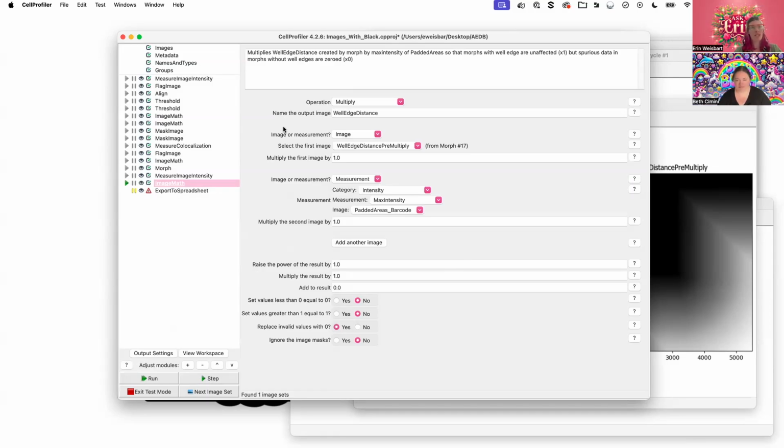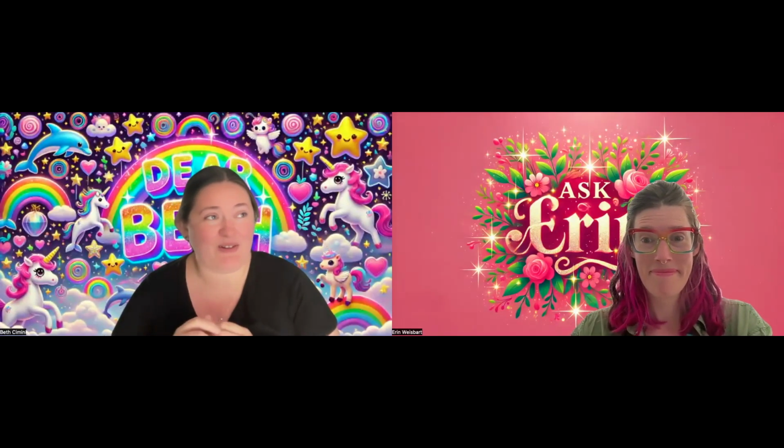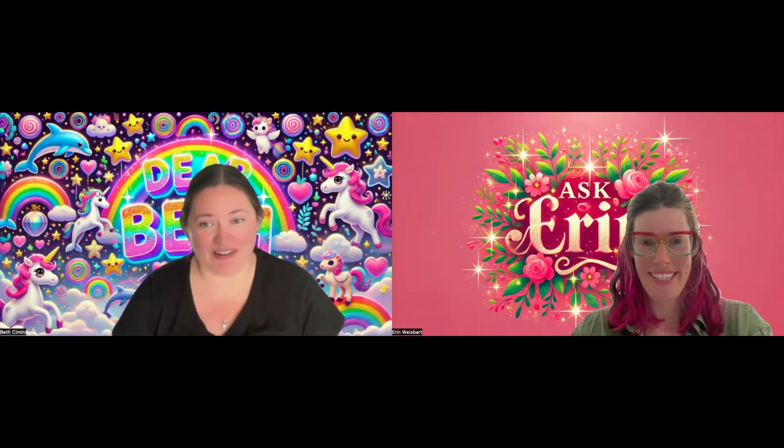Those are a couple of tricky, cool things one can do to help you deal with images that have zeroed areas in them, or areas with signal of zero. It's very cool. I'm guessing it took a few tries to get everything chained together and figure out what was actually going to be important there.